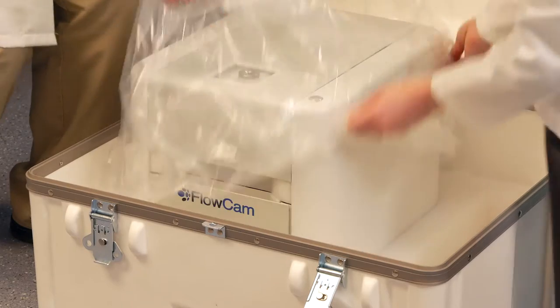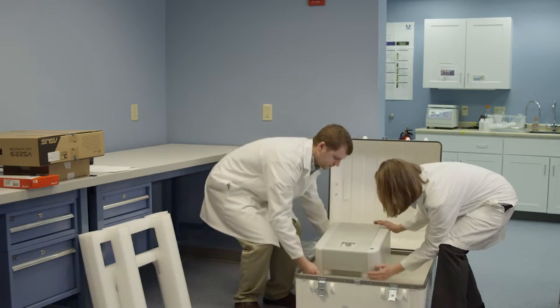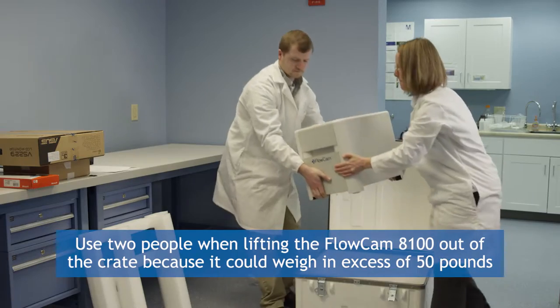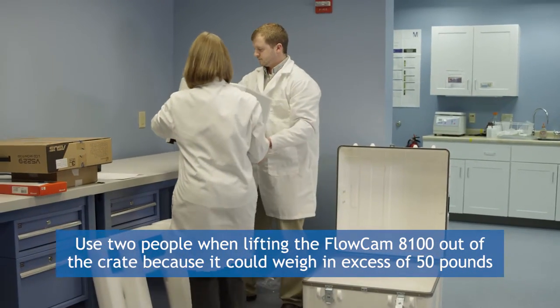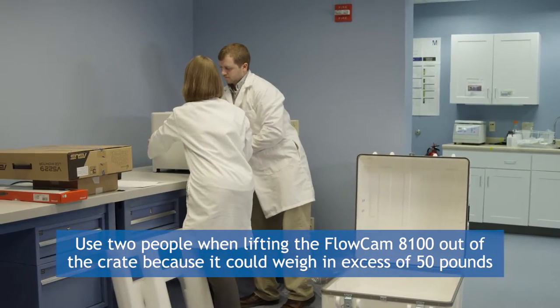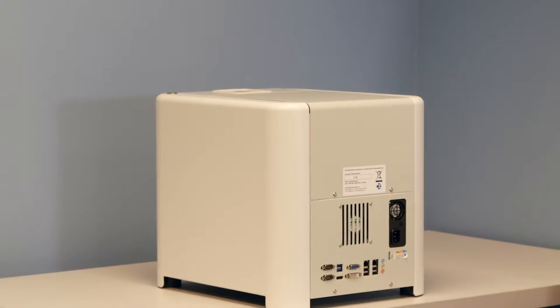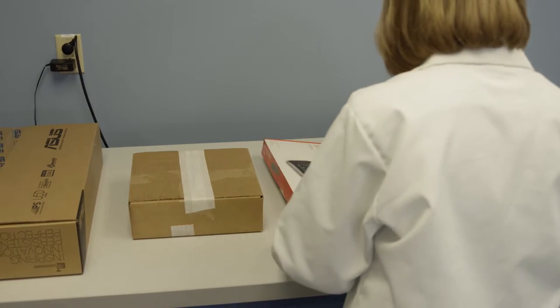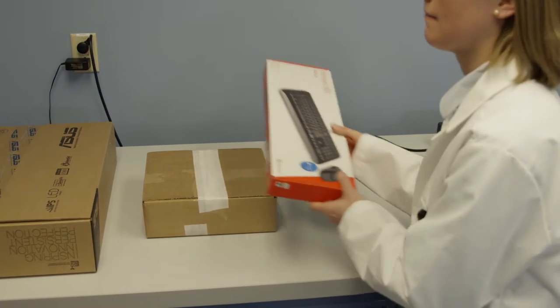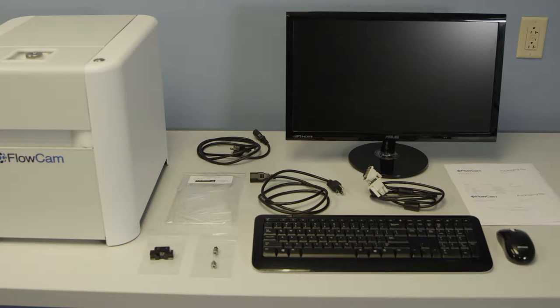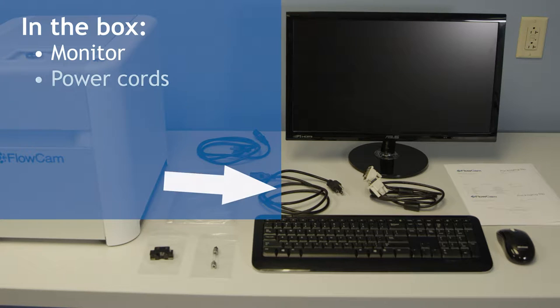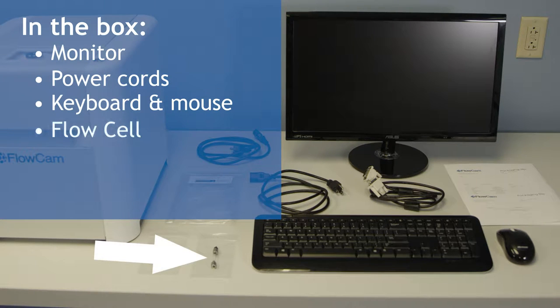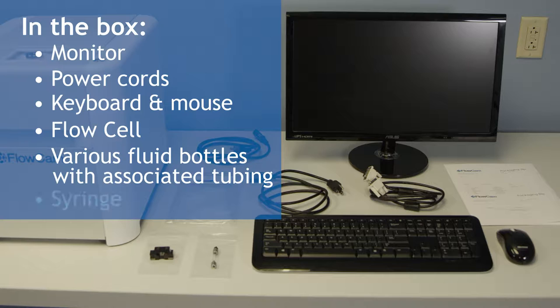Next, you will remove the FlowCam 8100. When lifting the 8100 out of the crate, we recommend using two people because it could weigh in excess of 50 pounds, depending on the model and type of 8100 you purchased. Place the 8100 on your prepared lab space. Continue to unpack and inventory the rest of the accessories from the various boxes and cases. Your new shipment should contain at least a monitor and power cords, keyboard and mouse, a flow cell to install, various fluid bottles with the associated tubing, and a syringe for pulling the sample.